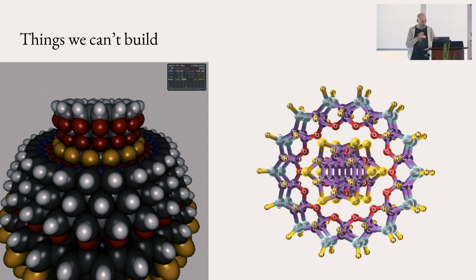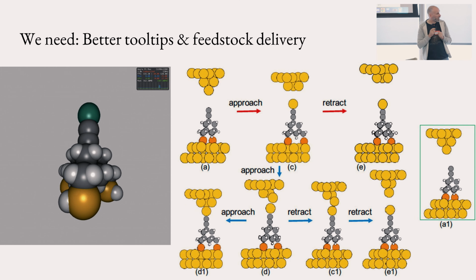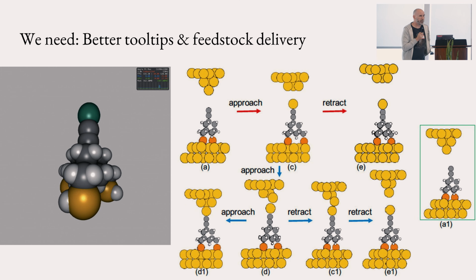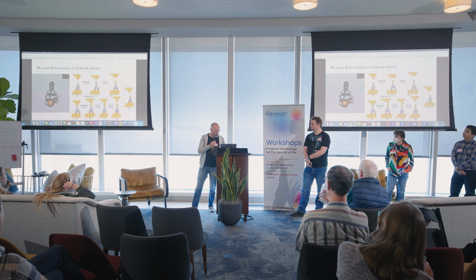The problem is, before we get to these lofty heights, we really need to think about just how we're going to engineer tips. And I think that's ultimately what we'd like to do as a seed project, or proof of principle: can we build up a nanoparticle with tips whose chemistry we control in a rather more precise manner than just crashing them into surfaces? I think that's really the focus of what we're trying to do here. Please jump in, everybody else.